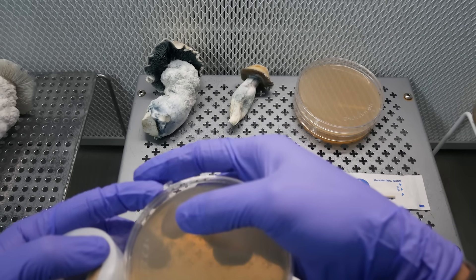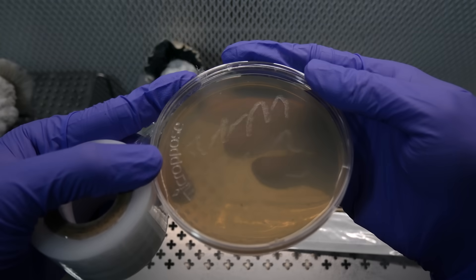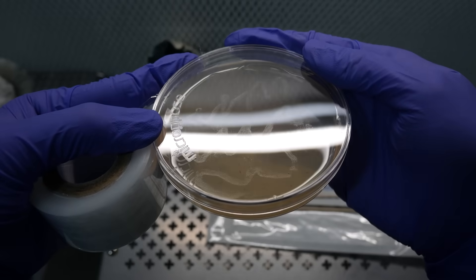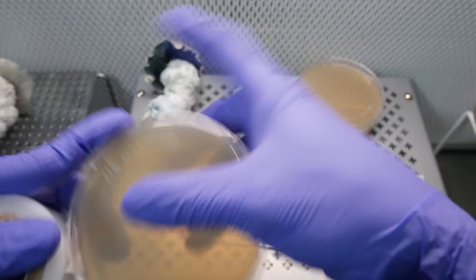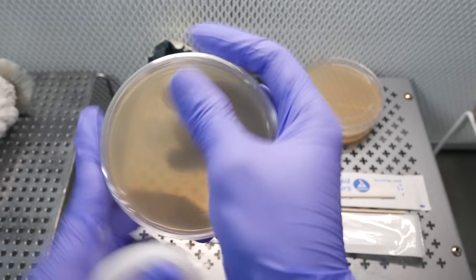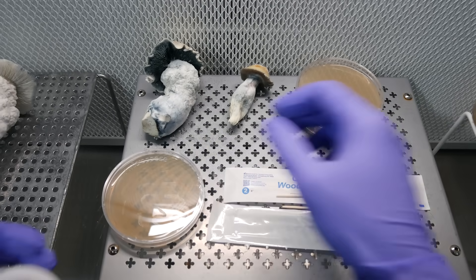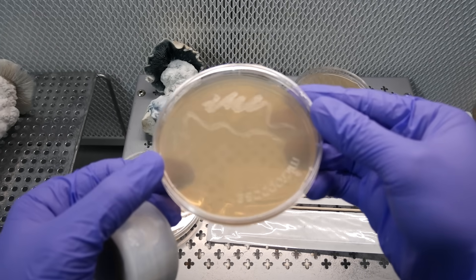Afterwards, we wrap up our plates. You can see the streaking across the surface — just to give you an idea of the fancy artwork I'm doing on my plates. I'm using grafting tape here; I find it's more effective than parafilm, so it's pretty much all I use now. Go ahead and wrap up the rest of these plates.